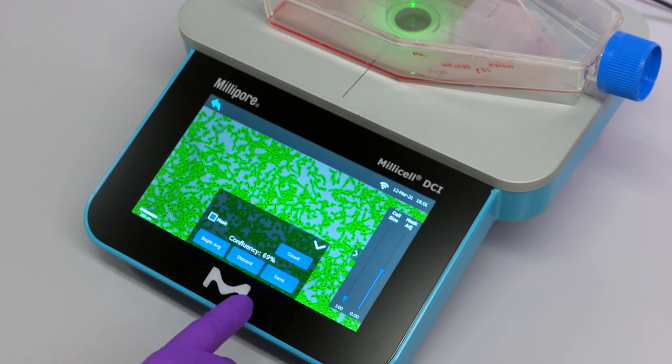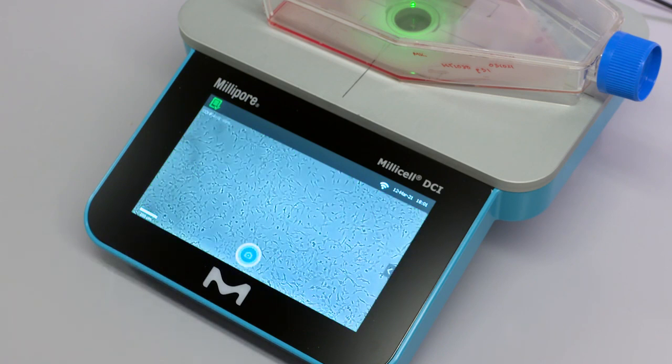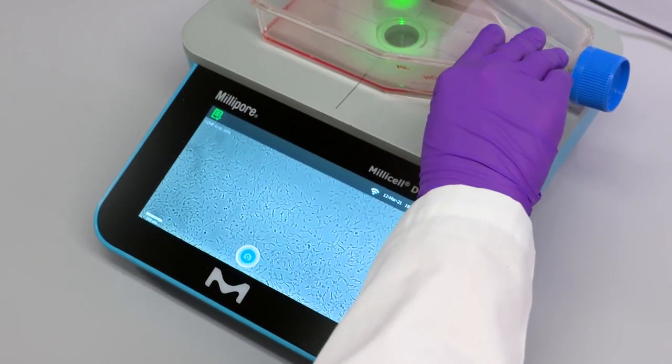To calculate the average confluency or cell count, click begin average within the box. Capture the desired number of images.